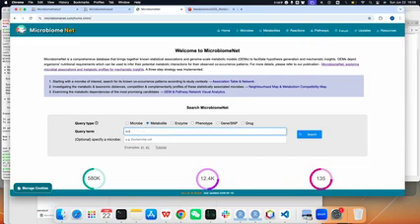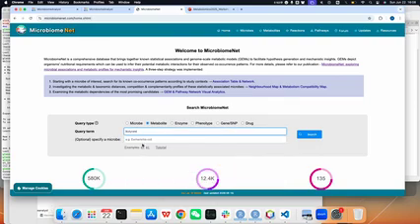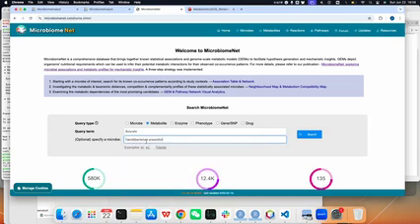These are beneficial metabolites, like we mentioned a lot in IBD. So maybe here we want to answer the question of how this microbe can produce or metabolize this short chain fatty acid.